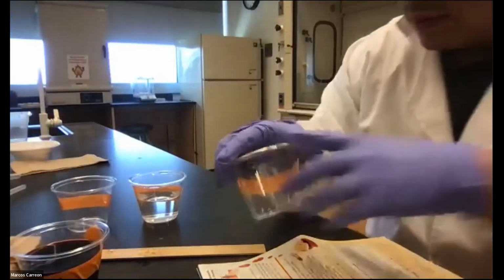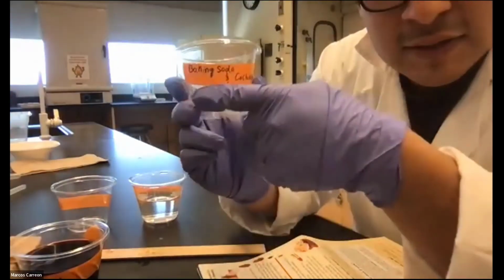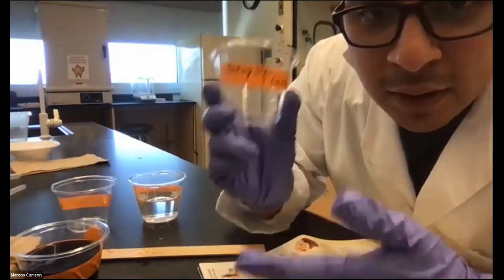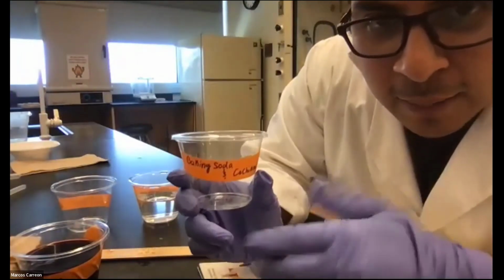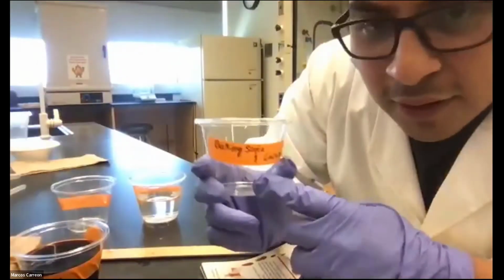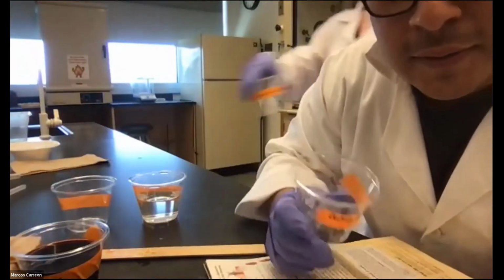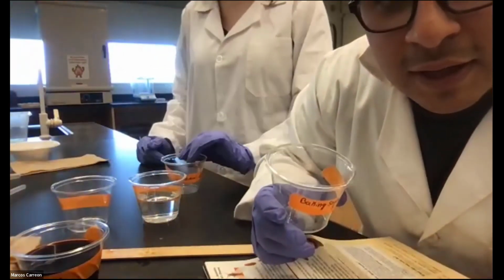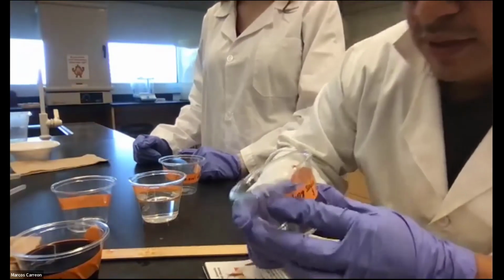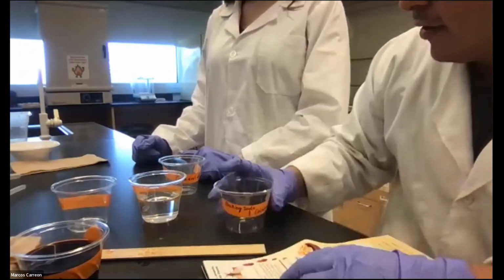So what we're going to do is add the cochineal dye into this one, and then add the baking soda. My question to you guys is, what do you think will happen? What kind of color do you think is going to occur? Orange, blue, green. You can discuss that amongst yourselves and guess what color will happen. Blue. Okay, we'll see what color it changed.